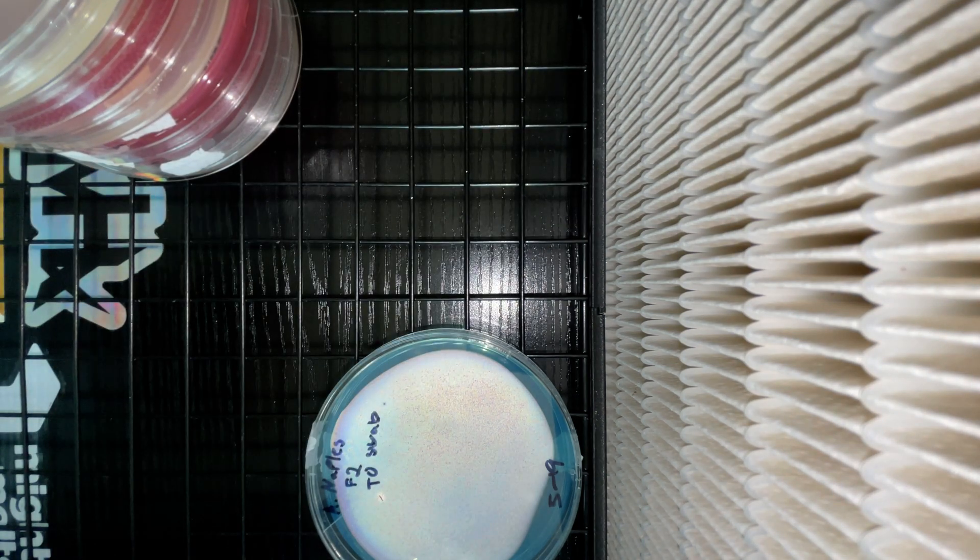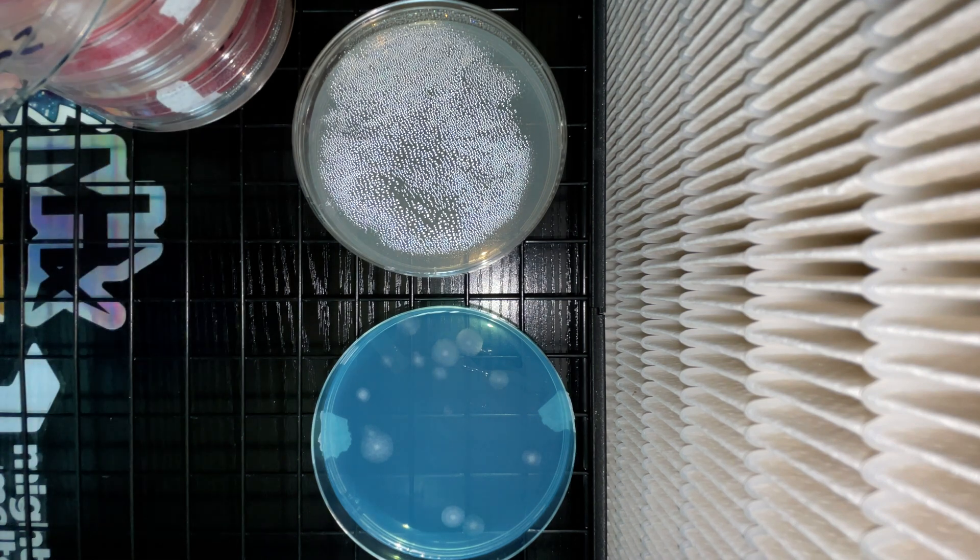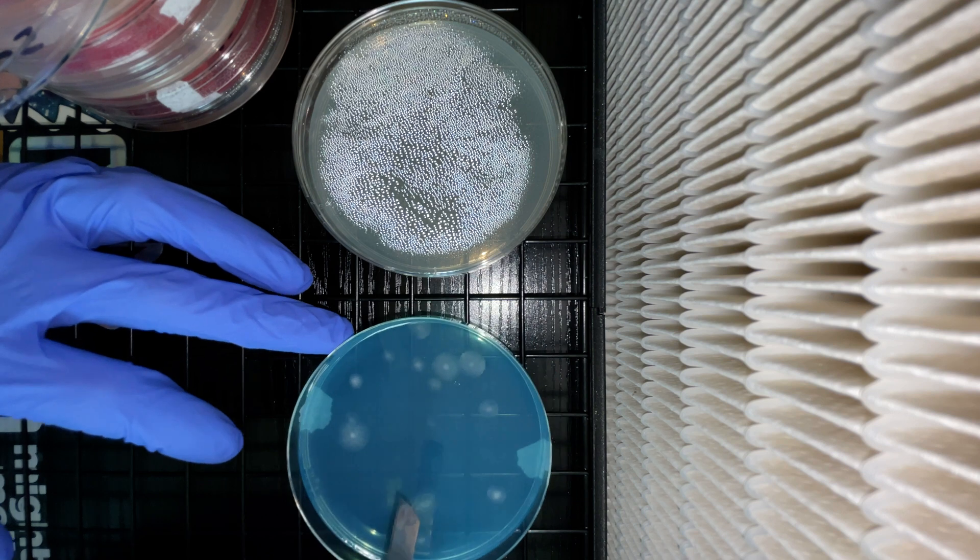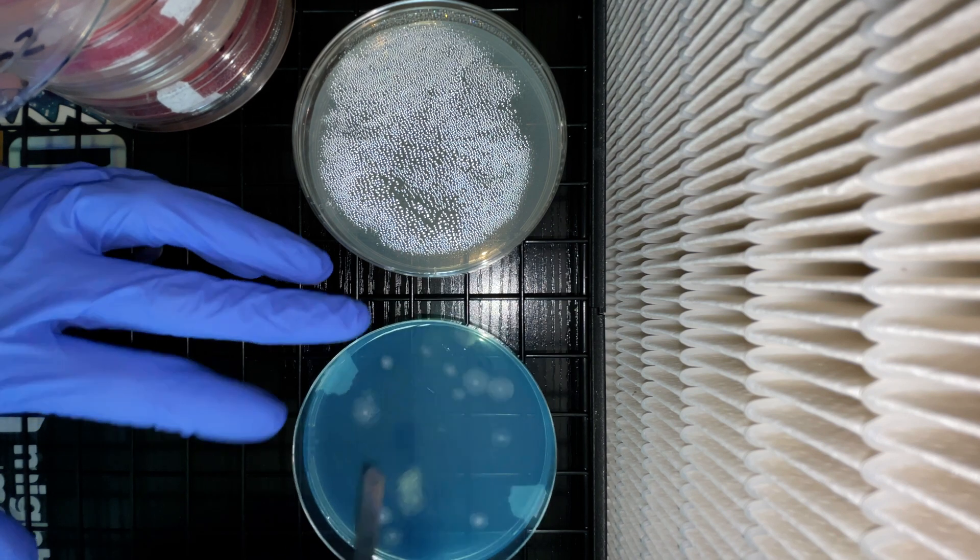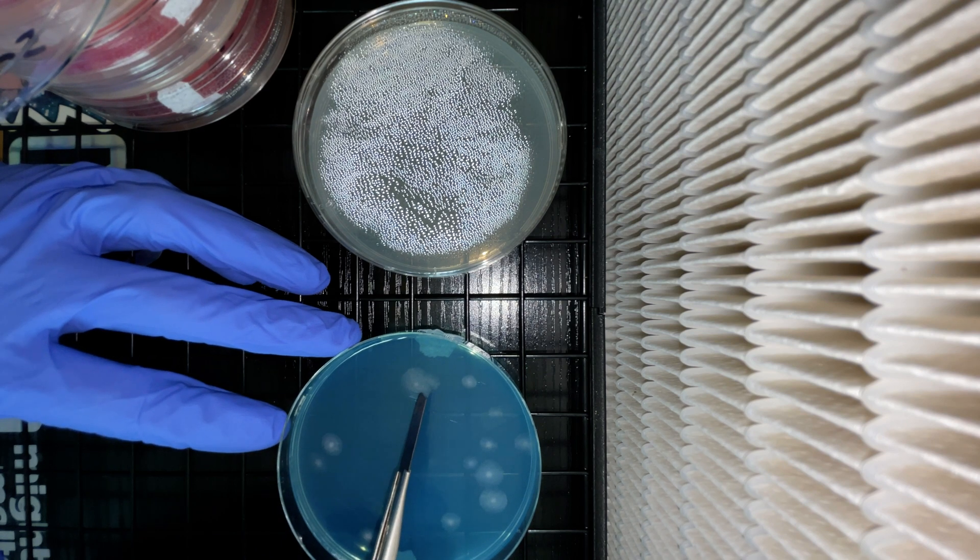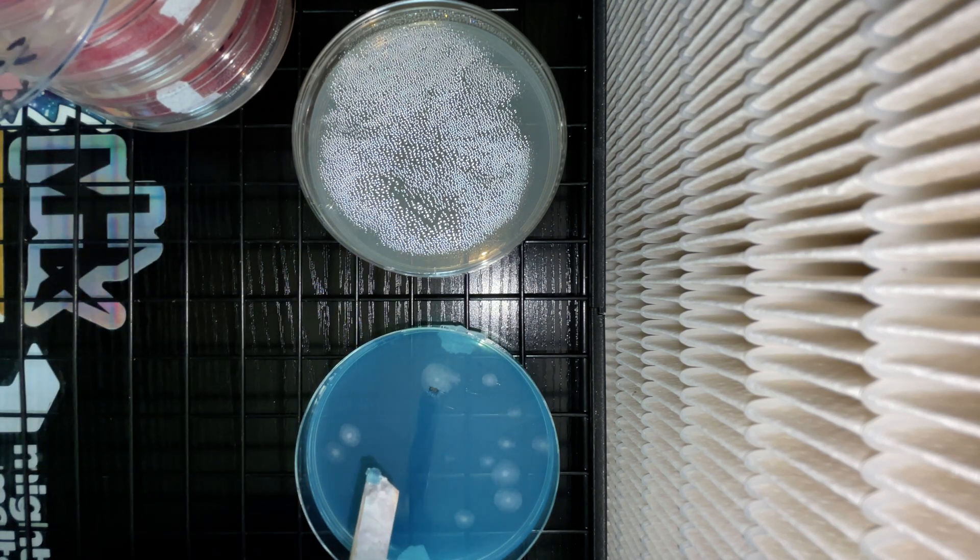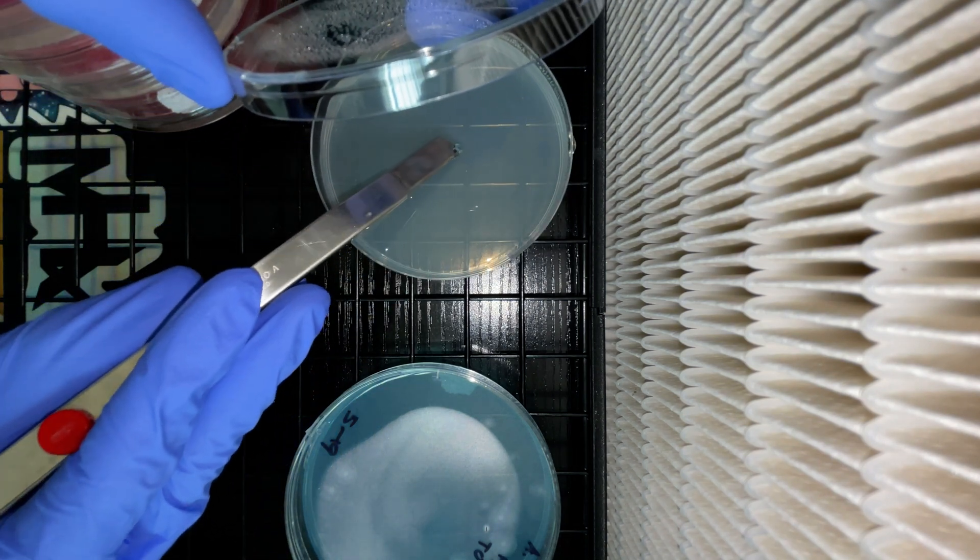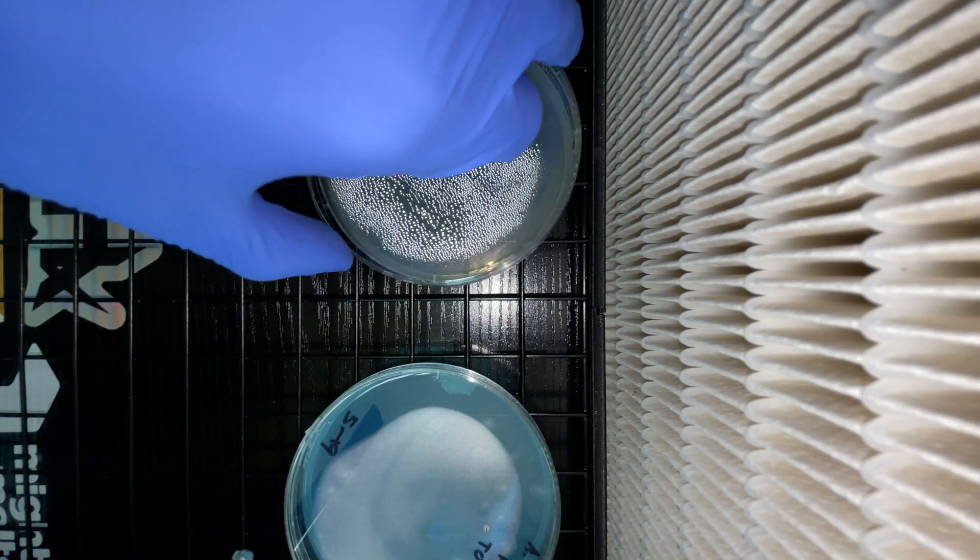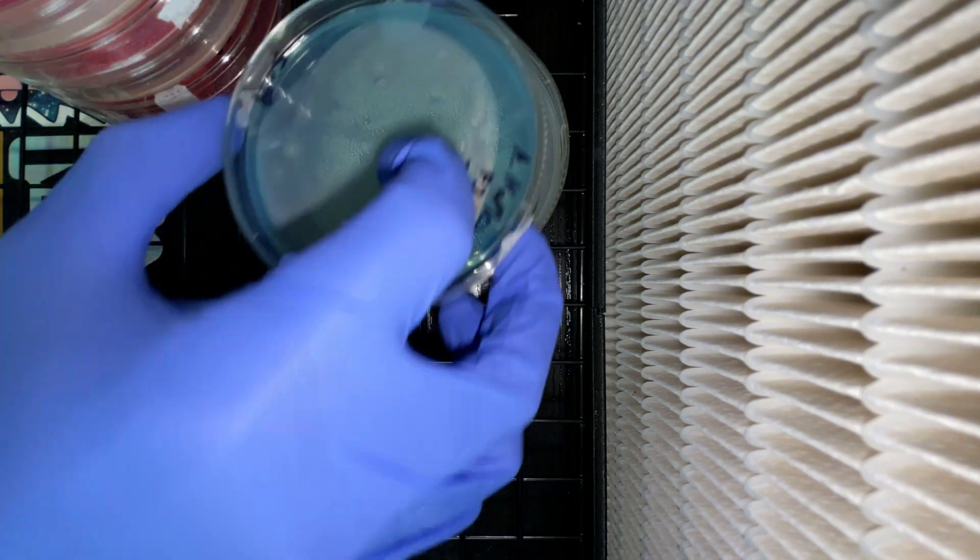Here is an update of the hybrid cross that we had started. While it's just barely germinated, I like to pull my little colony of mycelium sooner rather than later on a spore plate. I was looking for a germinated colony that had another one touching it. This would ensure that I don't accidentally pull a monokaryon and colonize a whole cake to realize it doesn't have its other half to even fruit. After that we just make sure to label and tape up all the plates. I use a cheap brand of micropore tape and tape the corners.